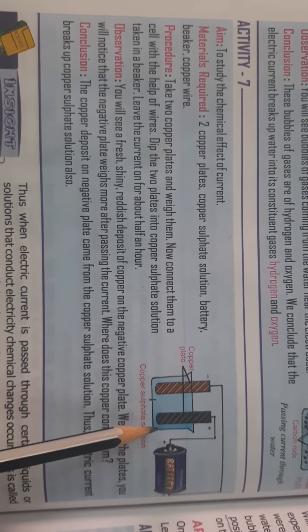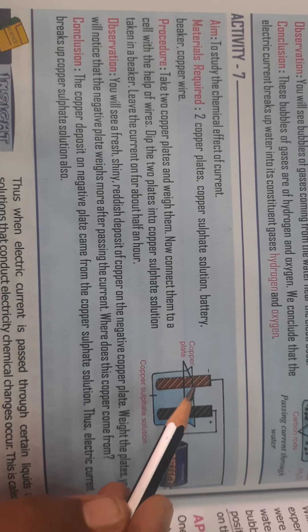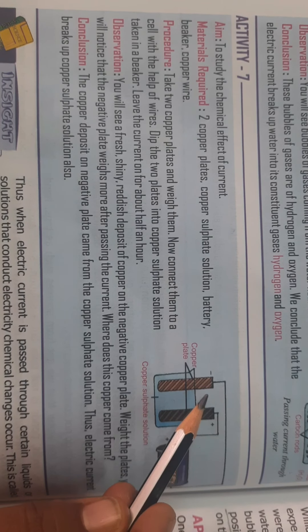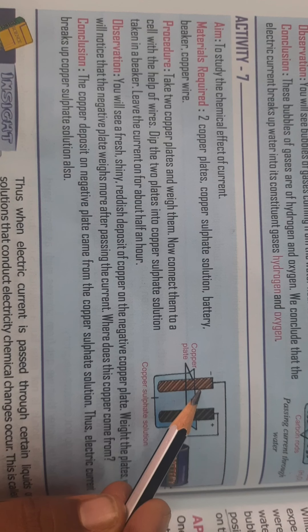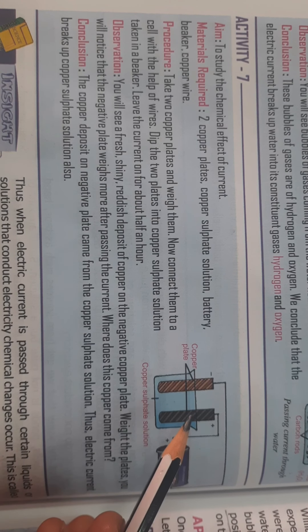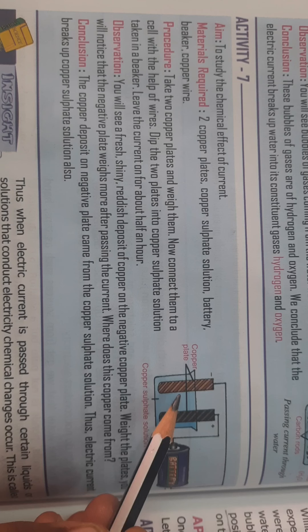After half an hour, you will see that there is a reddish deposit of copper on the negative copper plate. There is a reddish brown deposit, and when you weigh the plate, you will see that the weight has increased.